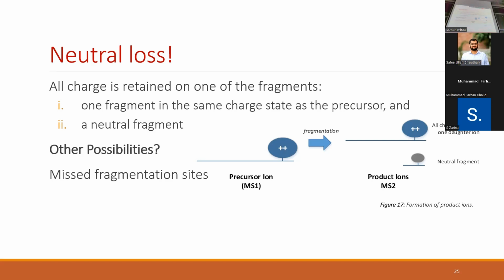If it doesn't have an overall charge, it's small, a few millions, it doesn't have a net charge, right? So that part is not contributing to the charge of the whole protein in the MS1 as well. Correct. Right? So what will be the result if you subtract that from the precursor mass? You know what I mean?